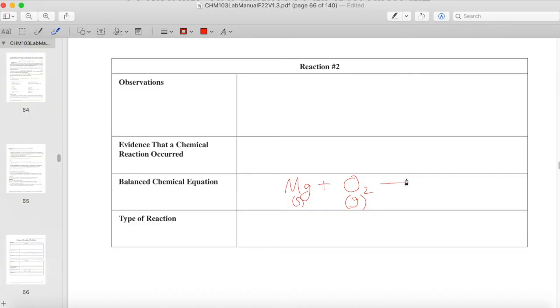All right, so that then becomes the white powder we see at the end, right? So we go from this shiny gray metal to a white powder, and so what is that white powder? Well, it is the ionic compound magnesium oxide, which, if you think back a couple of chapters, what's the formula of magnesium oxide? Well, magnesium has a 2+ charge because it's in group 2. Oxygen has a 2- charge. So the formula of magnesium oxide is just MgO.